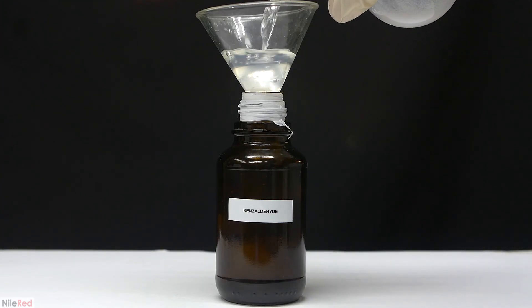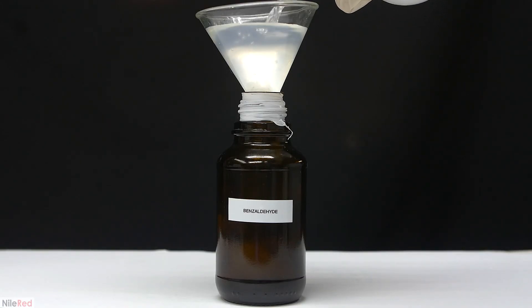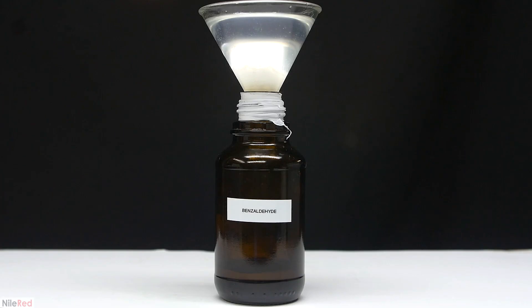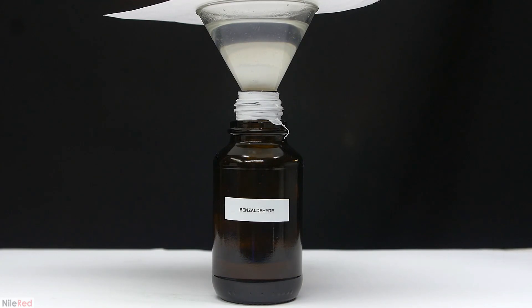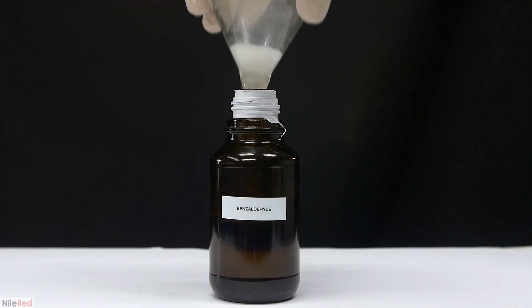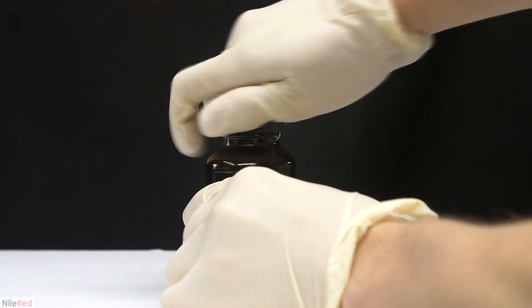Anyway, like before, the magnesium sulfate is separated from the benzaldehyde by just filtering it through some cotton. This time though, instead of filtering it into a round bottom flask, I'm filtering it directly into the bottle that I'm going to be storing it in. It does take a little bit of time to filter through, so to limit its exposure to air, I just put a piece of paper on top of the funnel.